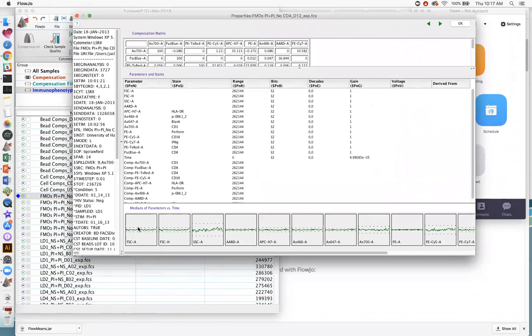And the little double dashed lines above and below the green line are the markers for where two standard deviations are either above or below that line. So if you get a spike that exceeds that double dashed line, you usually are going to get a red dot here. Okay, if it's touching that line or just below it, a lot of times you'll get a purple dot.